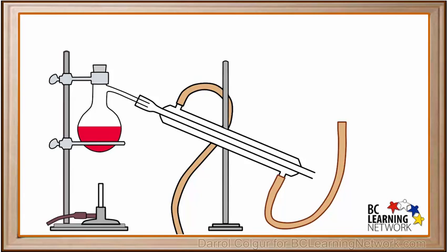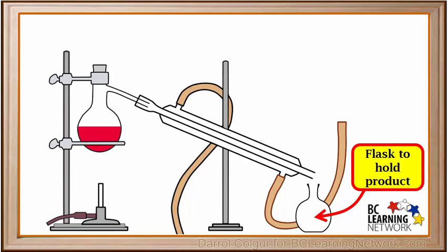Next, we'll add some rubber hoses to the condenser. We'll place an empty flask here. Later, it will be used to collect one of our products.